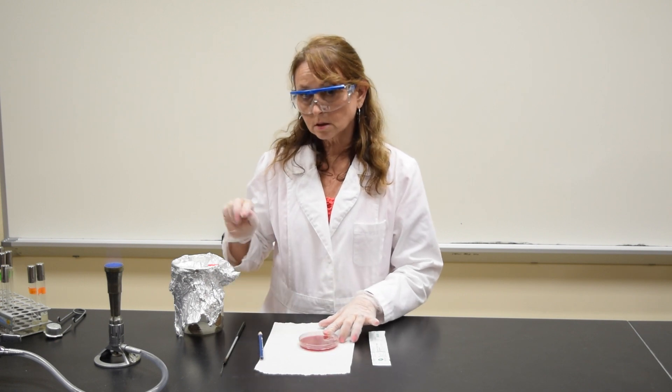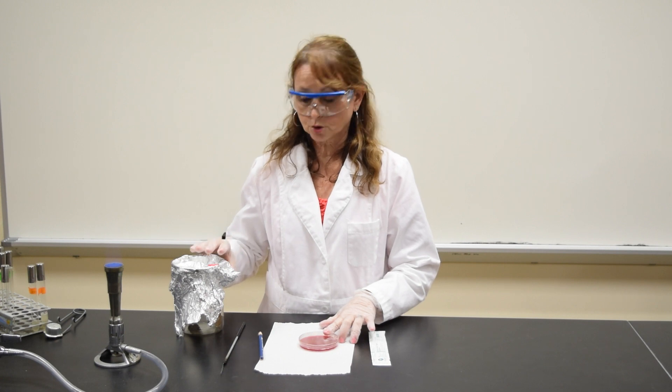You will need a sterile tongue depressor and a sterile swab to collect your specimen.